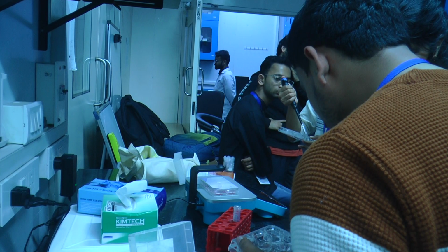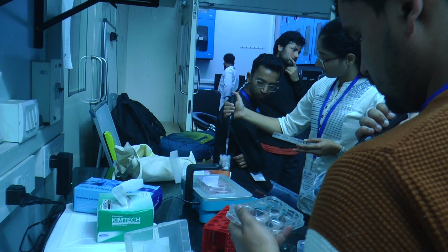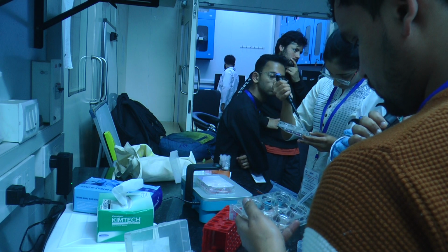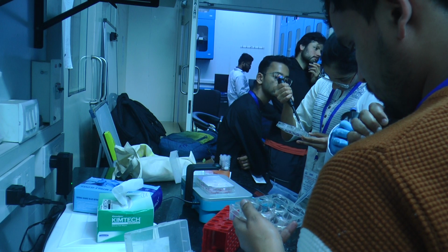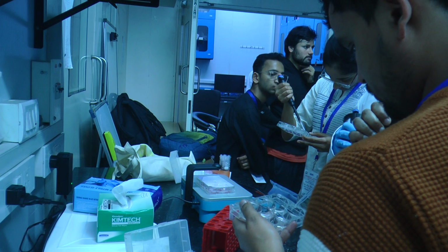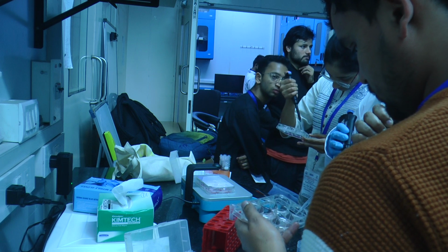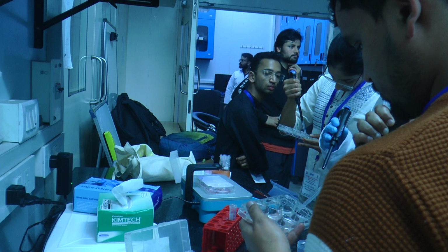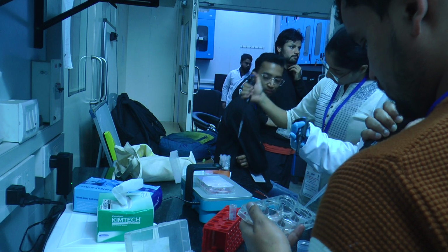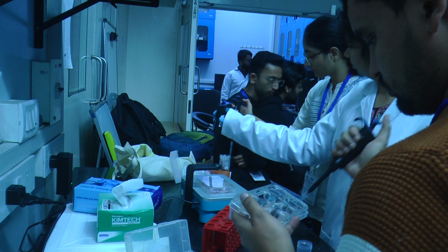We are also using this to wash off the cell debris, because we need only adhered cells. We don't need any cell debris interacting when we are doing the experiment. We only need GPMVs later on. So if anything is above that, we want to wash it off and keep only the adhered cells, so that when transformation happens.